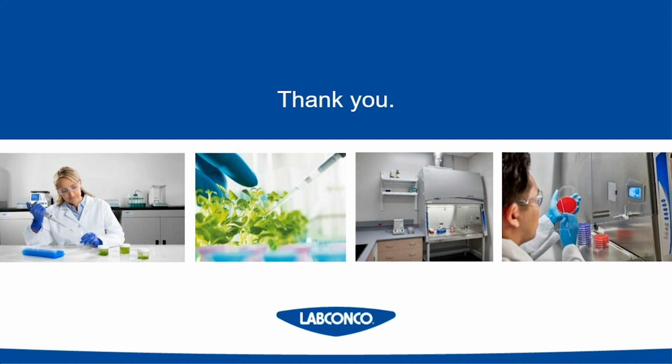What is the lifetime for an A2 hood and how is the maintenance on that? Okay. So typically, it depends on the manufacturer, but at LabConco, we would say our biosafety cabinets have about a 15 to 20 year lifetime. That being said, we have biosafety cabinets out there, people call about, that are over 20 years old.